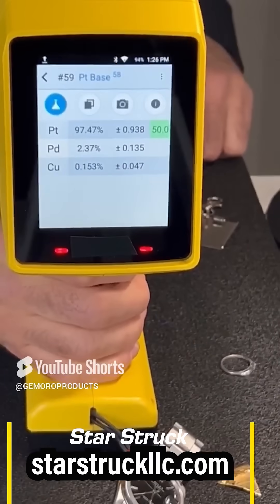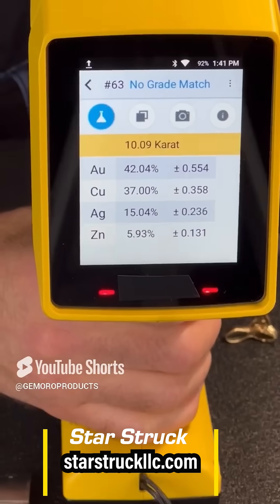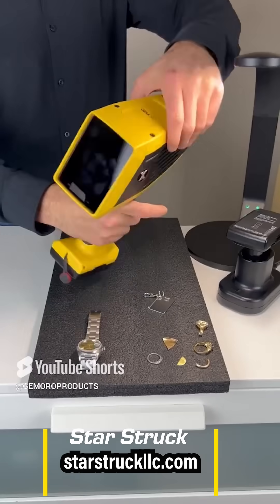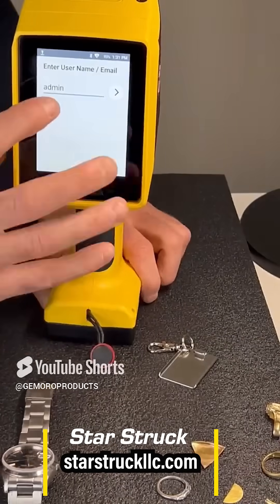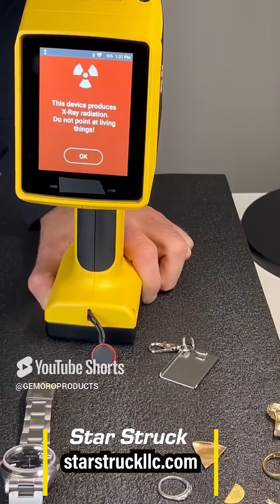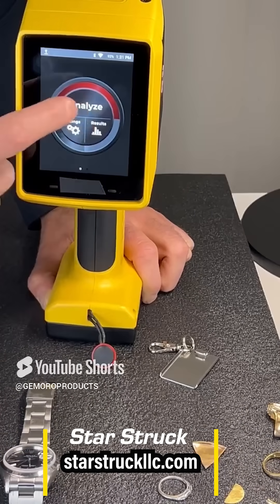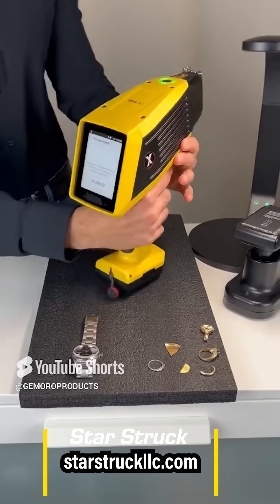Are you buying gold and still using acid testing? It's 2025 people. The Jamoro XRF Golden Precious Metal Analyzer is only $15,500 and it's made in America. It's got a silicon drift detector so you know it's testing parts per million level accuracy and detecting all those trace elements, so you can accurately test and easily view a full elemental concentration breakdown.